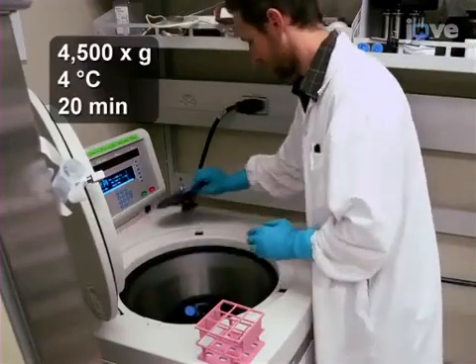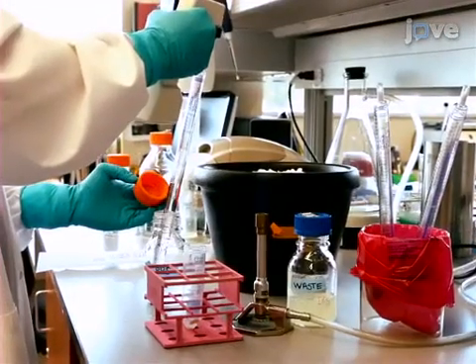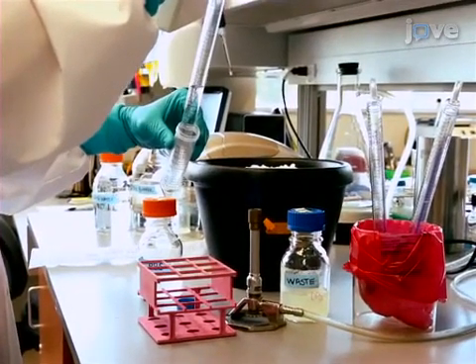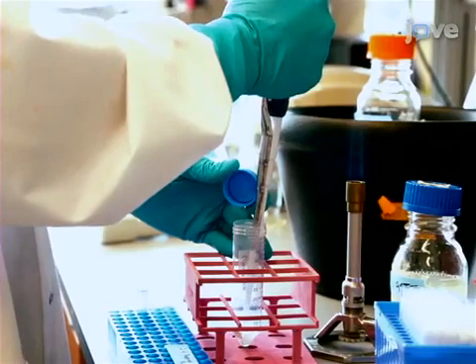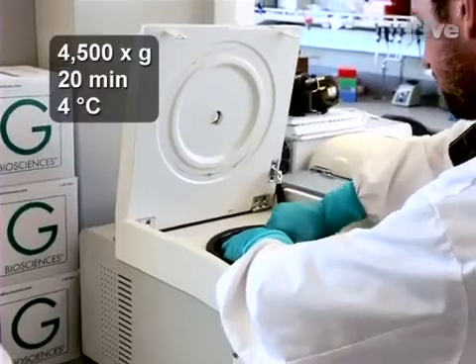Resuspend the pellet in 35 milliliters of cold PBS and repeat the centrifugation. After resuspending the pellet in 1 milliliter of cold PBS, transfer the solution to a sterile 2 milliliter micro tube and spin again.